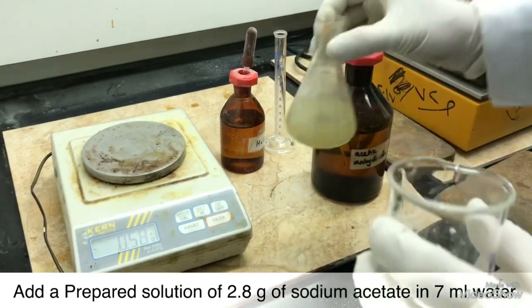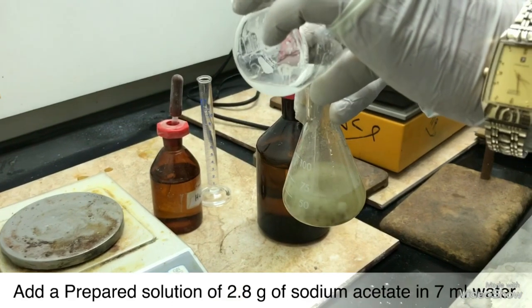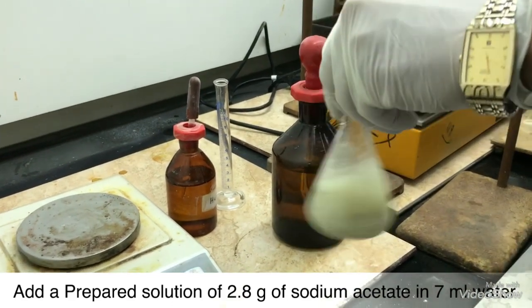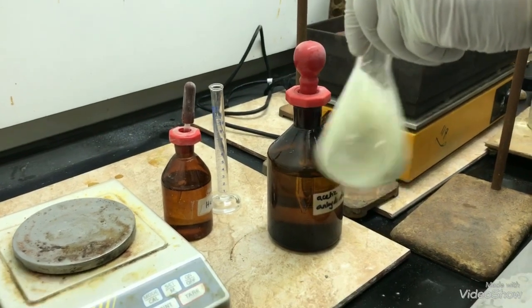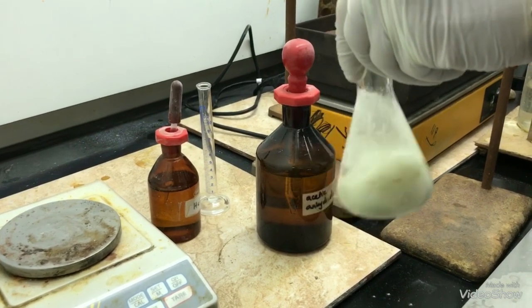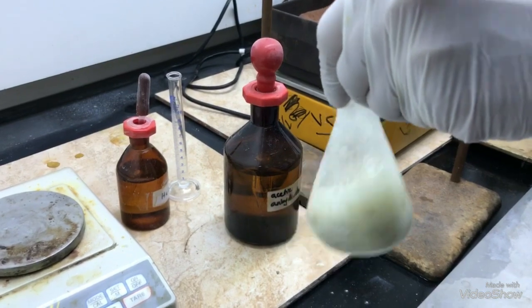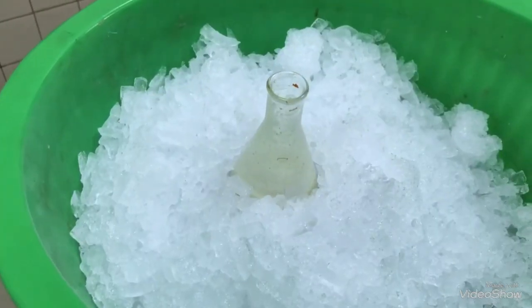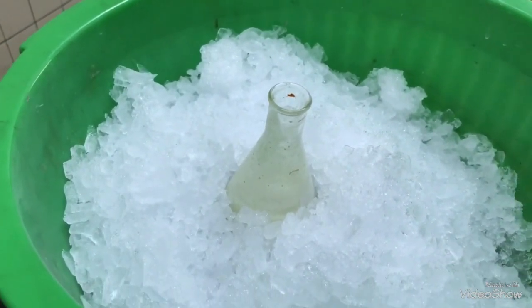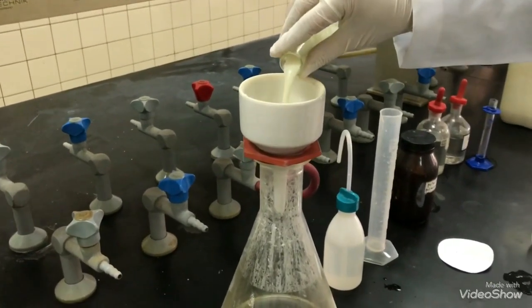Now add at once the sodium acetate solution that is previously prepared. Keep mixing the reactants thoroughly by swirling. Cool the reaction mixture in an ice bath for 3 minutes. Now, start collecting your product using suction filtration.